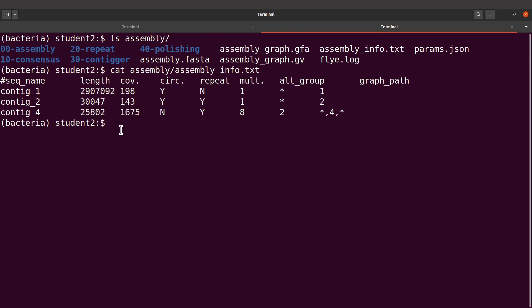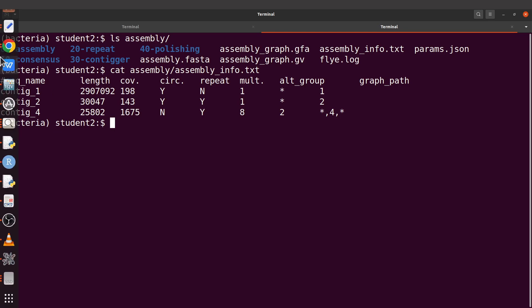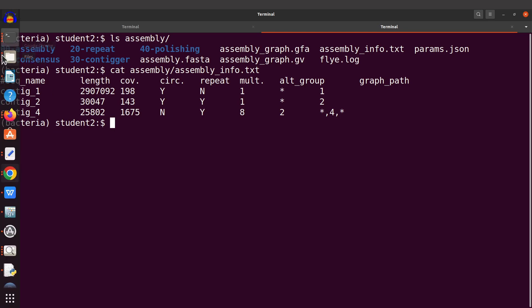We are going to focus on just this one here. Look at the length. If you take a look at the length we have here and compare to the genome length, we see some similarity.